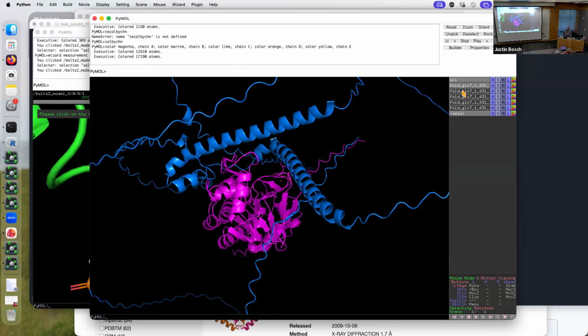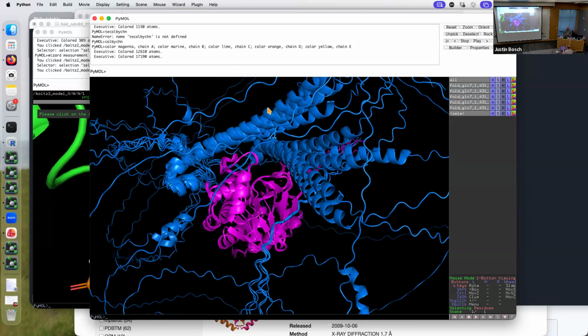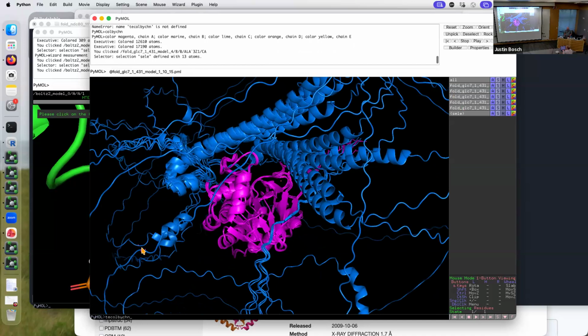So I want to do something called align. I'm going to highlight all the proteins, and I'm going to give a command, which I should have already done here. Maybe it's down here. Yep. I know this is hard to read, but down here it says the word align to, ALIGNTO, one word. I started typing the word fold, hit tab, and it completed the full length of this thing.